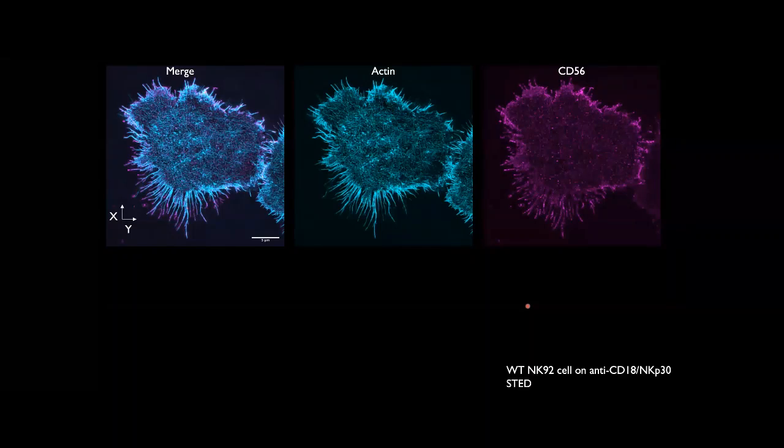So when we look at the expression of CD56 on human NK cells, in this case by STED microscopy, we've activated the cells on glass, and then we're looking back up into the NK cell. So this is looking right at the plane of the glass into the cell. We can see that, consistent with it being a cell membrane receptor, CD56 is found associated with the cortex of the cell, or with the actin cortex. And so we can see this branched actin network. We see CD56 out on the membrane.